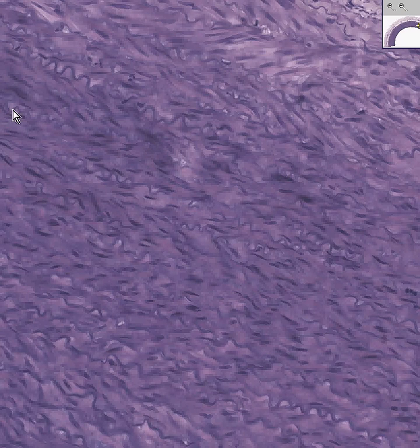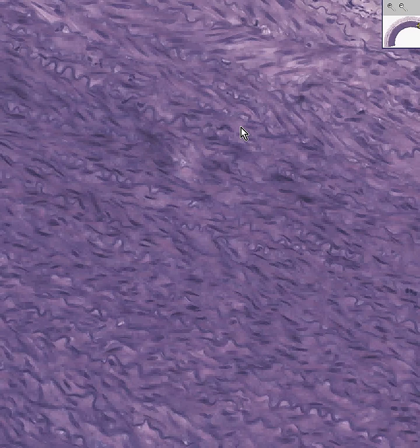Notice that most of these spindly cells here are smooth muscle cells. And notice that all of these squiggly little lines here look like little corkscrews all over the place. These are all elastic fibers. And that's why when an elastic fiber extends through the majority, if not the entire media of the artery, it can be called an elastic artery. And all of the major thoracic branches of the thoracic aorta are elastic arteries. And I thank you very much.